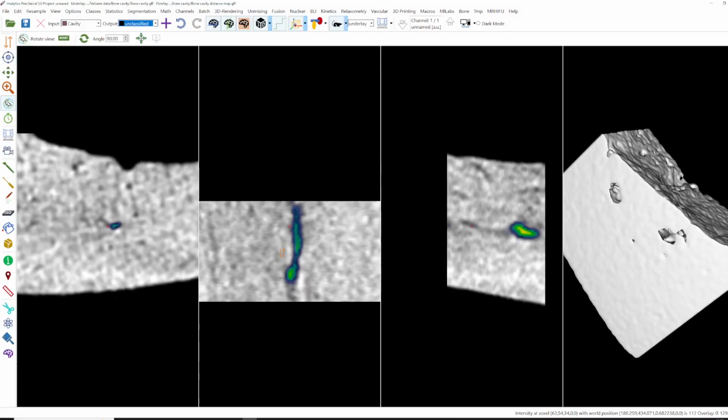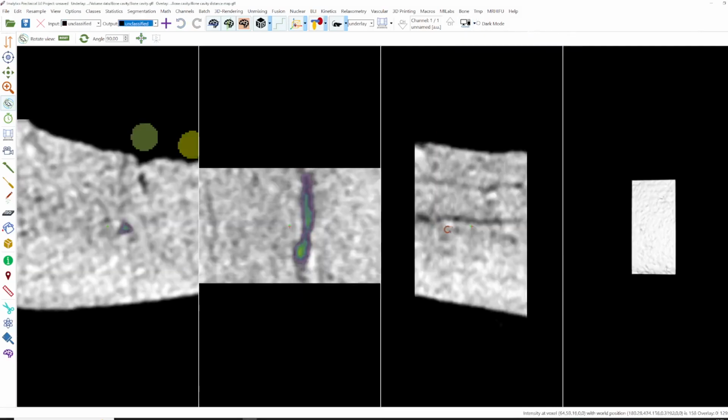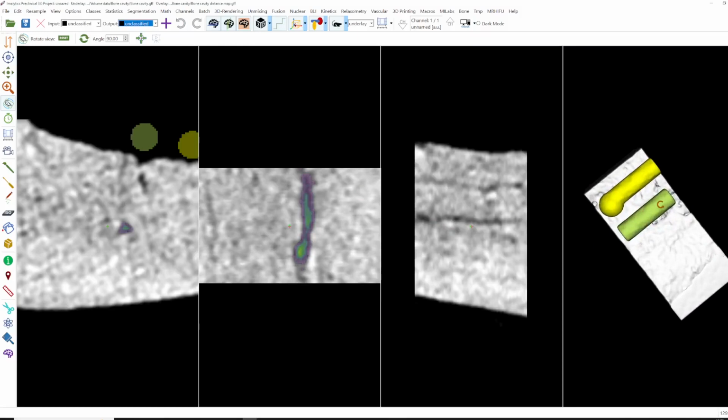To test if this works accurately, you can load an existing segmentation. Let me open the dataset again, because I showed you at the beginning we already have some segmentations here. Here in yellow is a match shape segmentation, and in green a very nice, perfect cylinder.